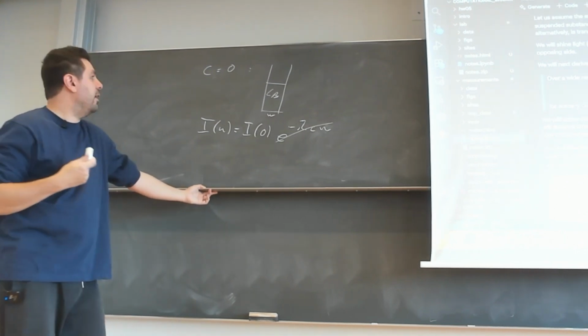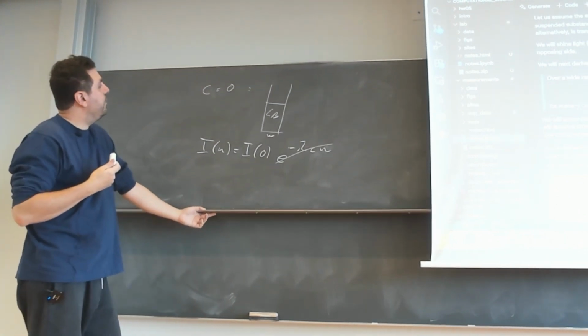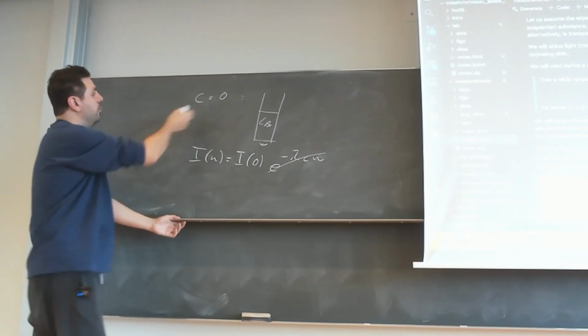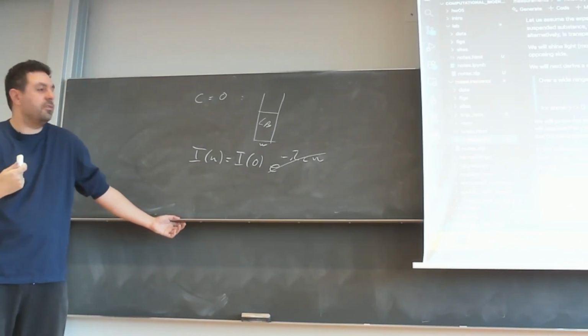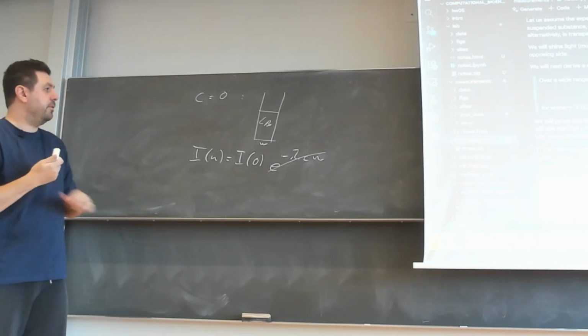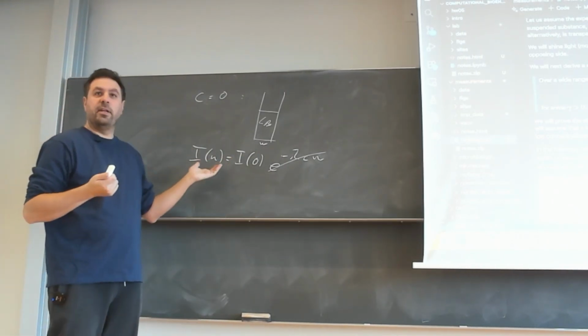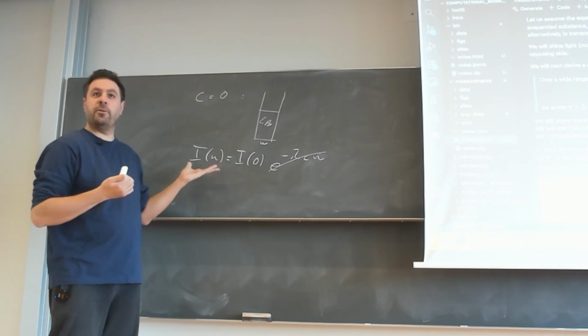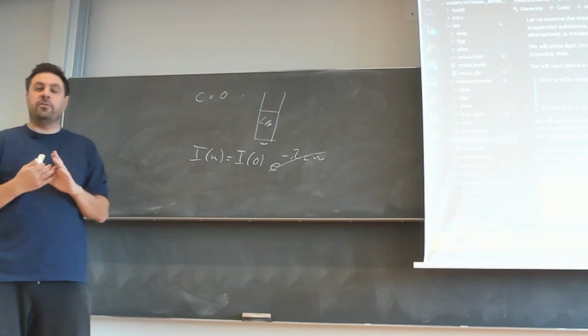Yeah? And this is also important because this is something people do, right? We will see this. This is called blanking, like measuring just the pure medium as a reference. That would not make sense, because why do a blank if I can just tell you it doesn't do anything? So of course it's not the case.